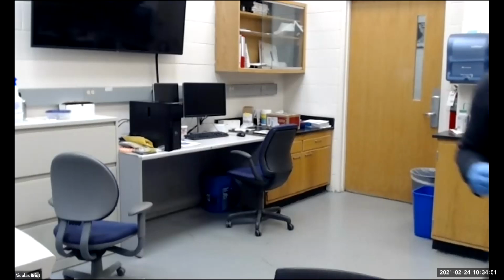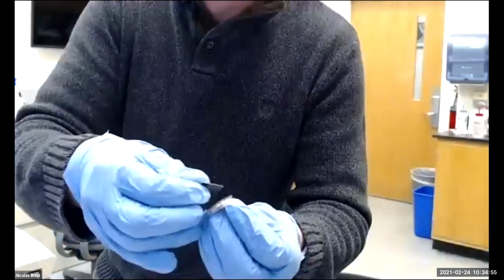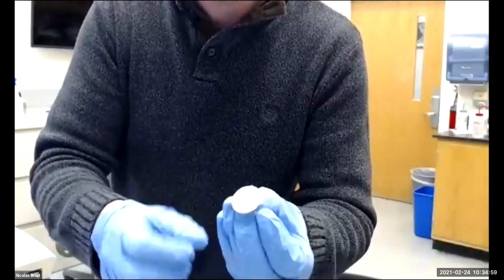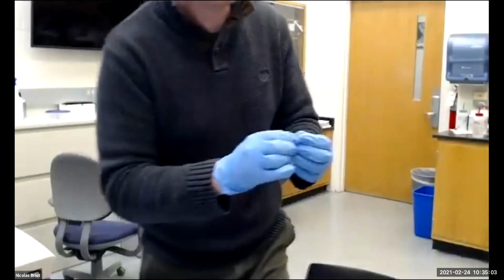So what I'm using is a little holder like this, and I'm putting a tape, just double-sided sticky tape, but it's loaded with carbon so that it makes it conductive. So it helps a little bit.